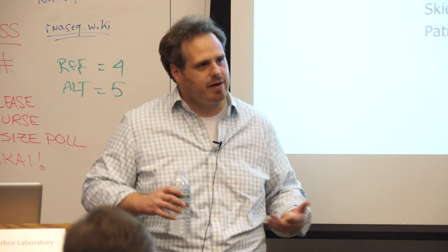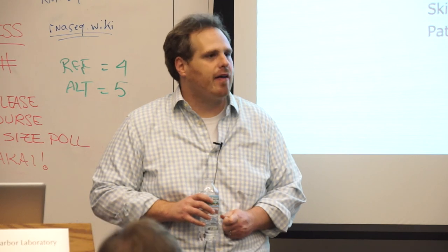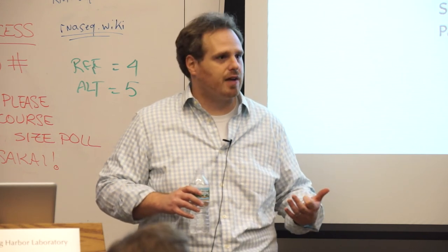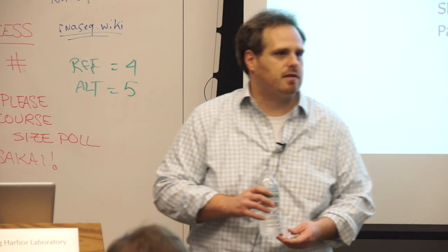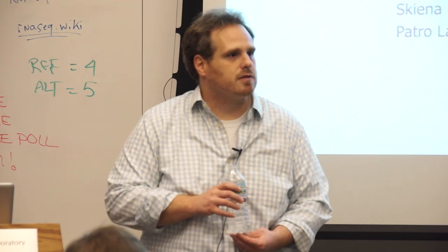We're going to have to use a combination of the technologies. We're on that path, but it's taking time. I do think it's remarkable that now, using PacBio technology for a few tens of thousands of dollars, we're going to close gaps in the reference that's been worked on for like a decade. So I think it's just an awesome time to be in genomics where these technologies exist.